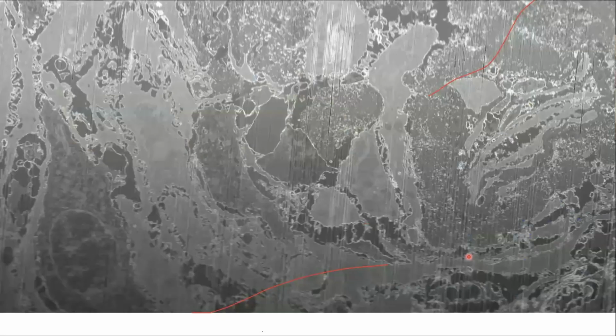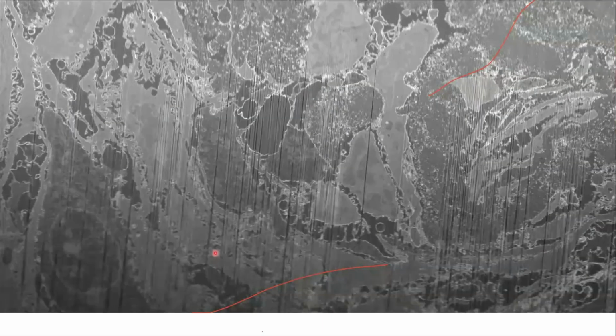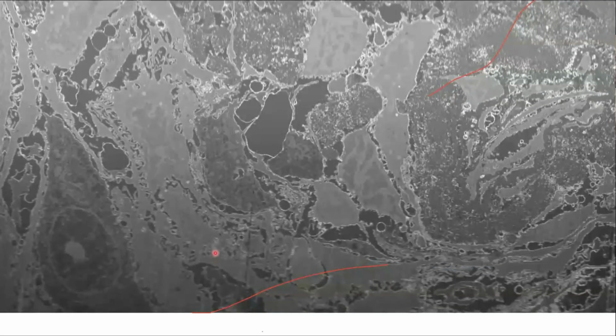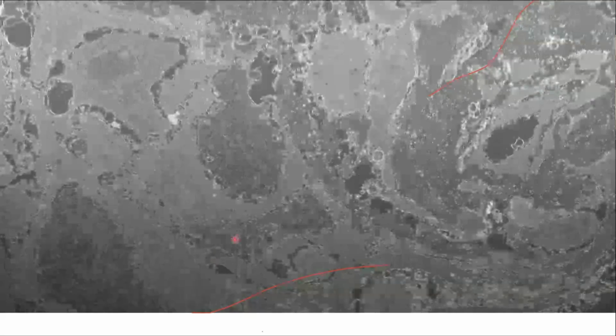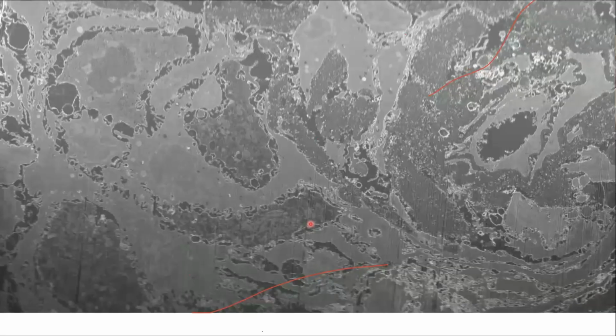So see, at the initial point, this is when we were using xenon for trenching and imaging, or for SEM imaging, these curtain lines appear. So we learned that by changing just xenon to oxygen, this sample is going to be much better.